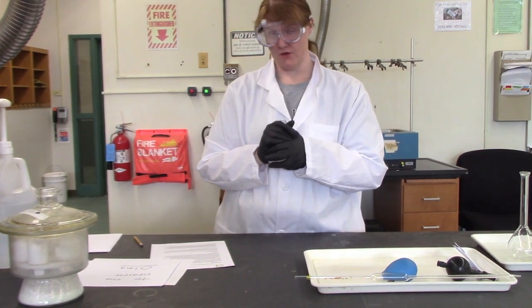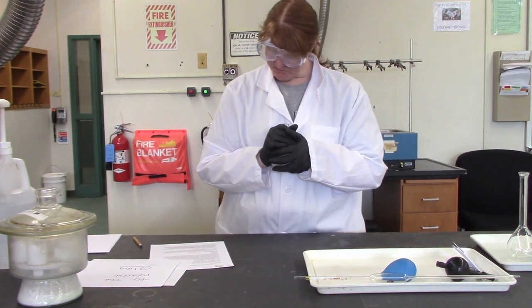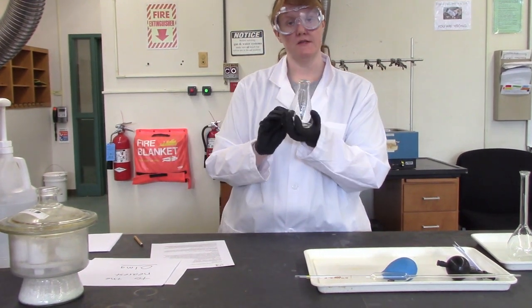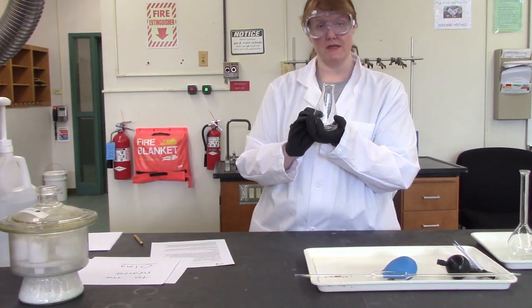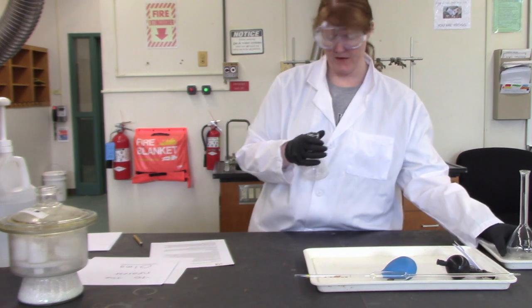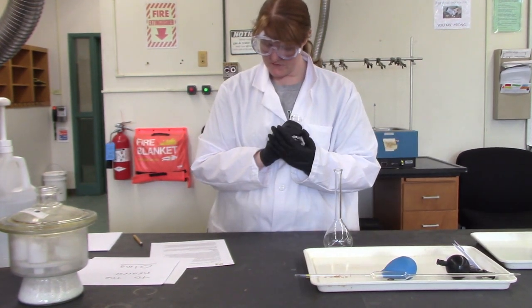Again, check with your teacher before you do this to make sure you have the right amounts to add. Then you're going to put in a little bit of distilled water so that you can dissolve this, which makes it easier to transfer, okay? You don't want to put in a whole lot, but you do want it to dissolve.